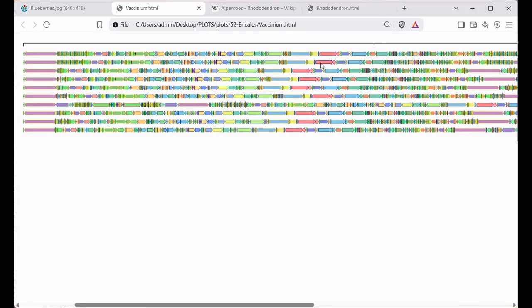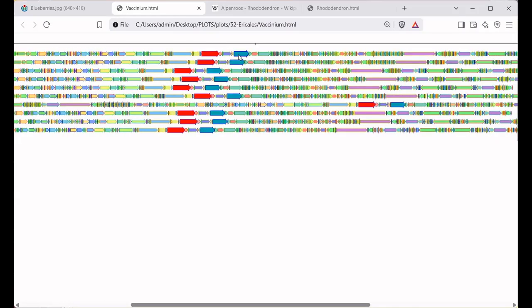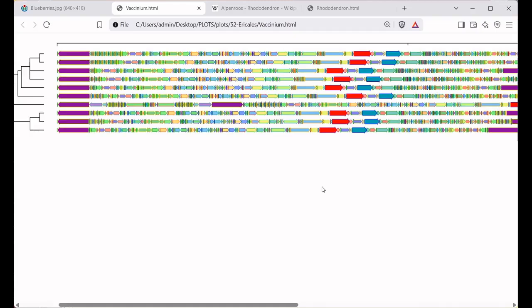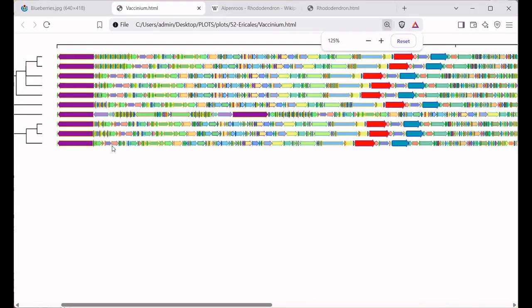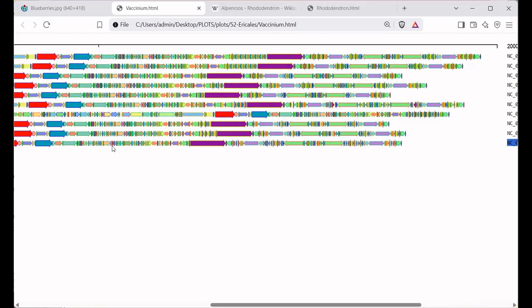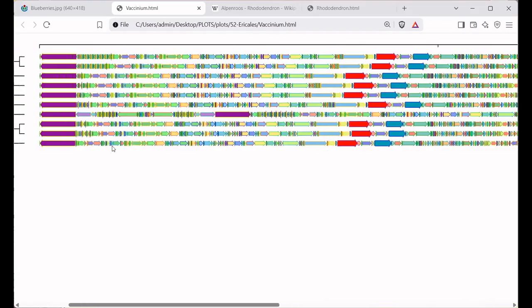And then, although there are similarities between these various plots, for example, you can highlight these sections, all these sections, but still you see that there are portions which are quite divergent. Like, for example, this particular one has all these sequences which look highly fragmented and divergent from each other. So I'm not sure what that means. To understand that, we have to go and look into the sequence at the gene level and try to analyze what is happening.